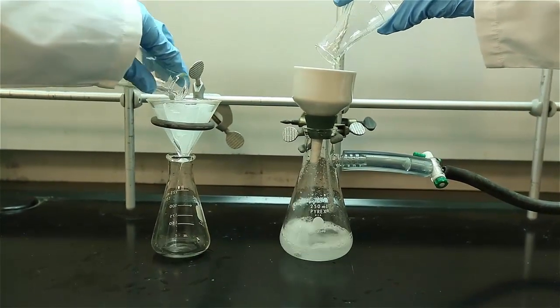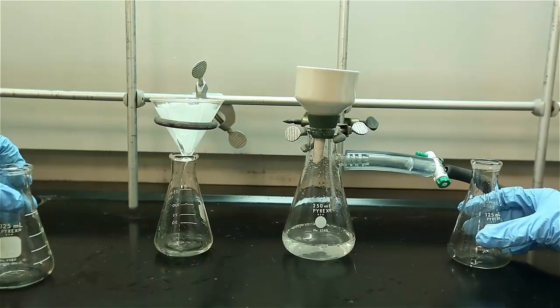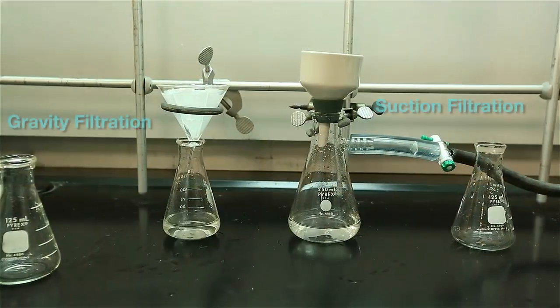As a general rule of thumb, suction filtration is normally done to keep the solids while gravity filtration is used to keep the liquids.